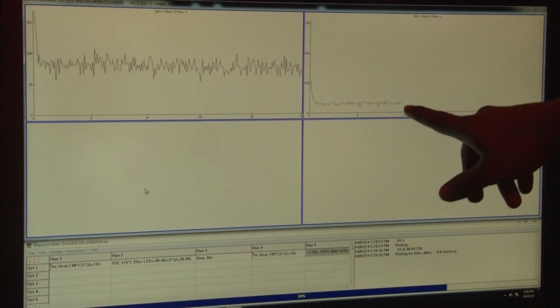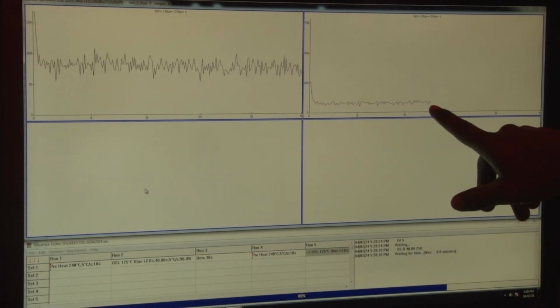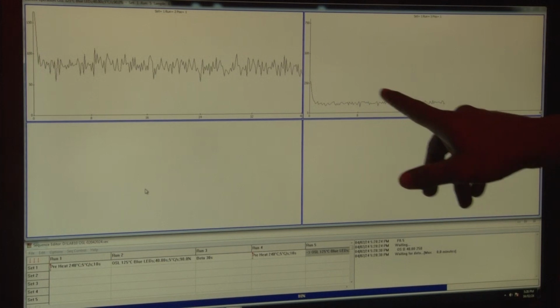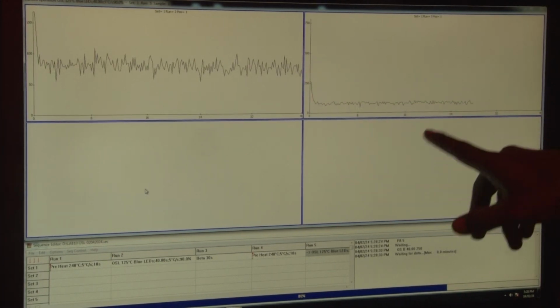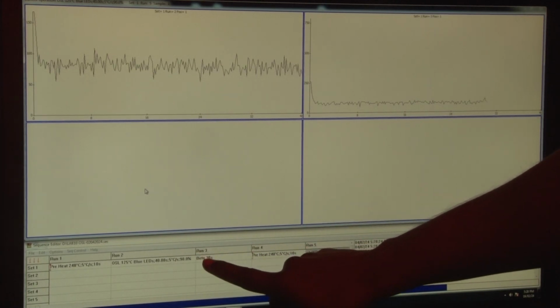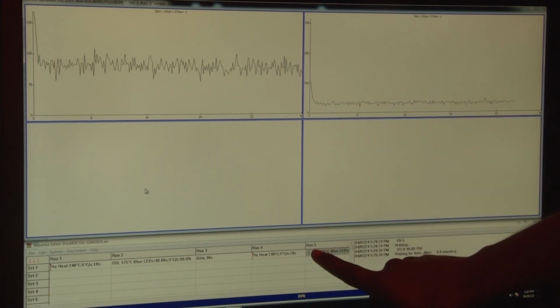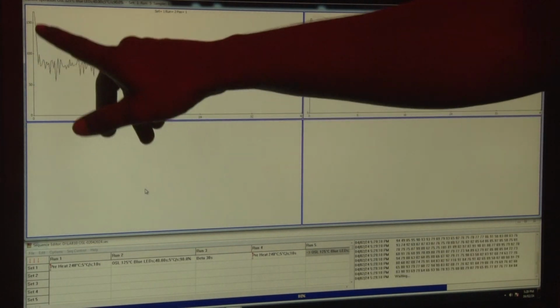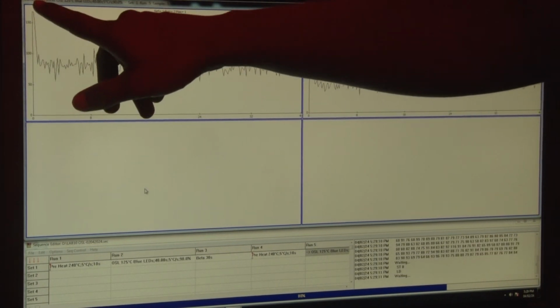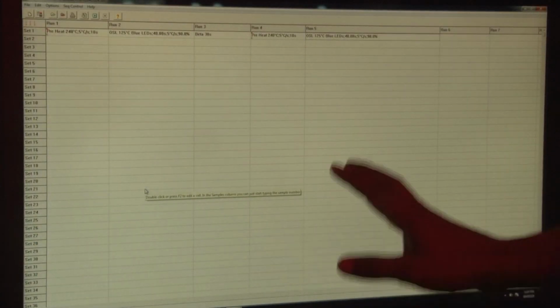So here you can see this curve is what you are seeing on the screen. This is the regenerative curve. This curve has been built after you apply the 30-second beta dose to the sample, and then you are exposing the sample with the blue LED. So you are getting this curve. The photon is around 250, and here also you can see it is more than 150. So it is quite similar to what we can see over here. So your analysis part has been done.